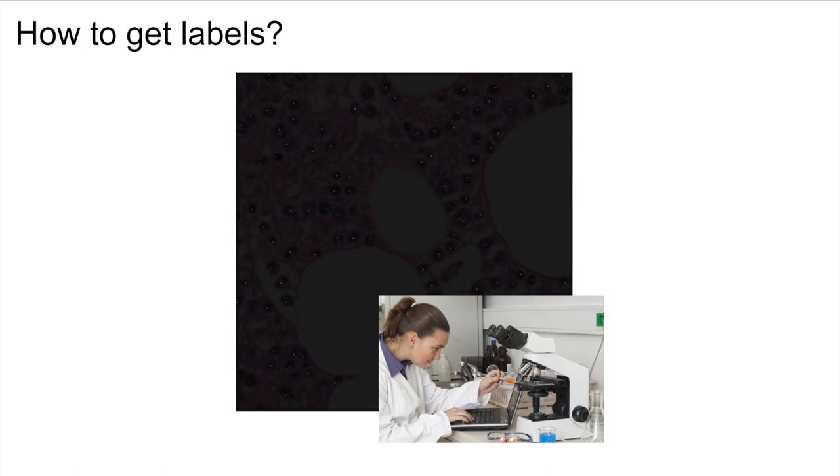In order to automate this task, we need labels. Existing methods have their limits, and drawing a segmentation for each cell manually is very labor-intensive. One very straightforward approach is to simply put a single pixel dot in the center of each cell. This is already what is done for manual cell counting tools in ImageJ. We can use this as the foundation for cell counting with deep learning.